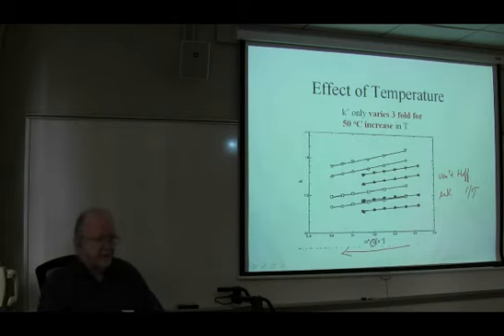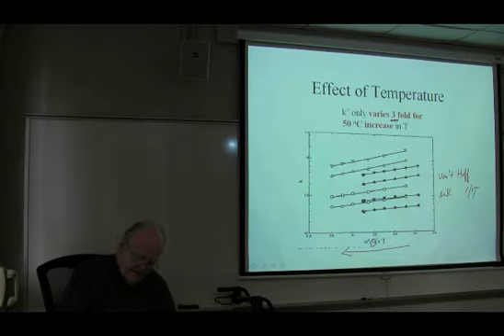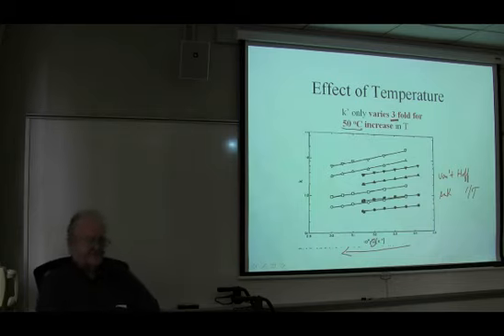Generally, this is a very small, I shouldn't say very small effect because you're going to think it's negligible. It's not negligible. But typically, we're looking at about a 3-fold decrease in retention for about a 50 centigrade increase in temperature. That's a lot less than what we see in GC. Typically in GC, we see a 2-fold change in retention for a 10-degree change in temperature, maybe a 3-fold change for a 10-degree. So that's 10 versus 50. That's a big difference. Slope is much smaller.